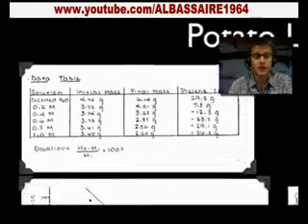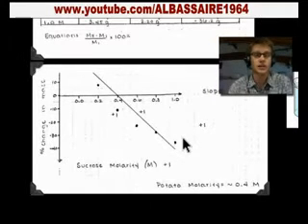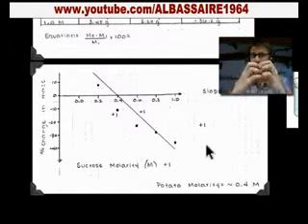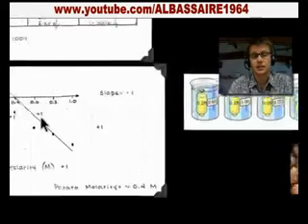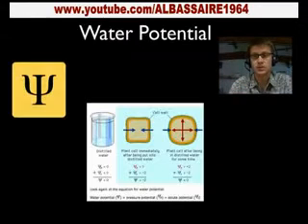And so if we graph it, this is the graph, our independent variable then is the sugar concentration, our dependent variable is that percent change in mass. And so you can see as we increase the solute concentrations in each of those beakers, we see a decrease in that mass. In other words, they shrivel up. Eventually, on either side of this graph, that cell wall actually acts as a constraint. In other words, it can't get too big because the cell wall is going to hold it in there, and it can't shrivel up as well because the cell wall is going to hold it in place. And so that's the osmosis lab, and the slope of that line is going to tell us the change in the percent mass related to solutes in this case, since we're not measuring time.